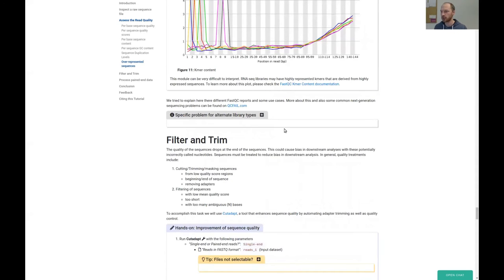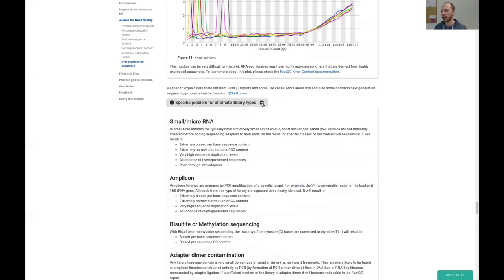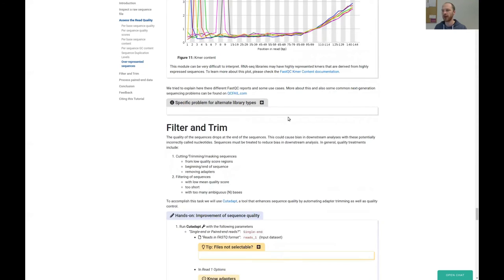With that we come to an end of the FastQC part. There are many more scenarios and things that can happen to the quality of your data. If you see something and don't know what it might be, follow the link in the hands-on material where you'll find more descriptions about what kind of quality breaches might happen and what they look like.